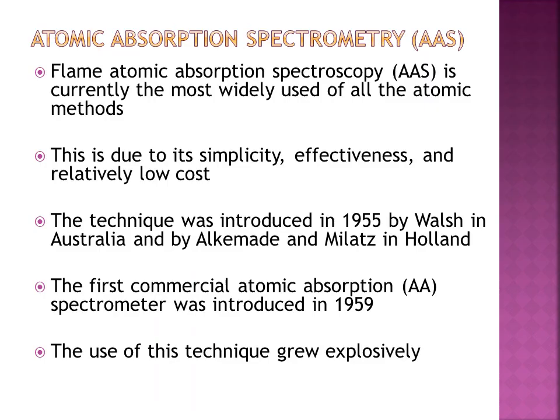Now we will see atomic absorption spectrometry, AAS. Flame atomic absorption spectroscopy is currently the most widely used of all the atomic spectroscopic methods. This is due to its simplicity, effectiveness, and relatively low cost.